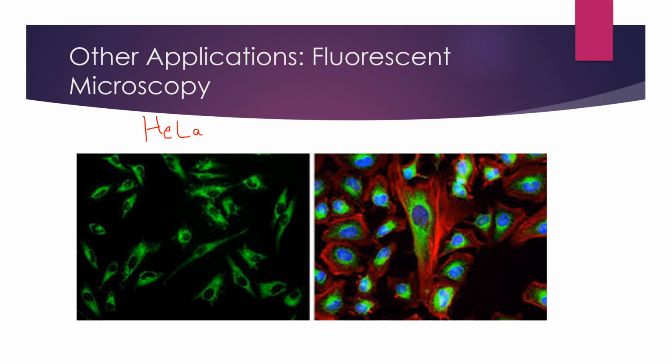The really cool part about fluorescent microscopy is that you can overlap images. You see the green here, but we also have blue, and we also have red. These are different stains that can be measuring different things, such as fibers, strands, dead parts of cells, active parts of cells. The list goes on. This is a very important aspect of biomaterials, especially if you're working with a drug delivery scaffold. You want to be sure that your cells are able to live, that the drugs are delivered accurately, and delivered over time in an appropriate manner. Fluorescent microscopy is just one way to do this.